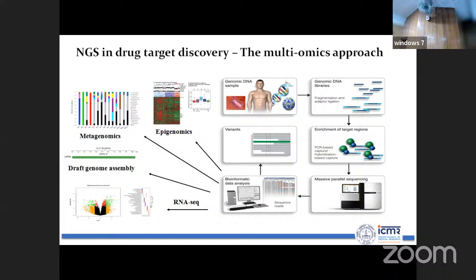Your goal should be those variants which are uniquely present in the drug resistant strain and absent in the susceptible strain. If you can identify such variants, then definitely you can link them to the drug resistant phenotype, and probably use that in disease diagnosis.